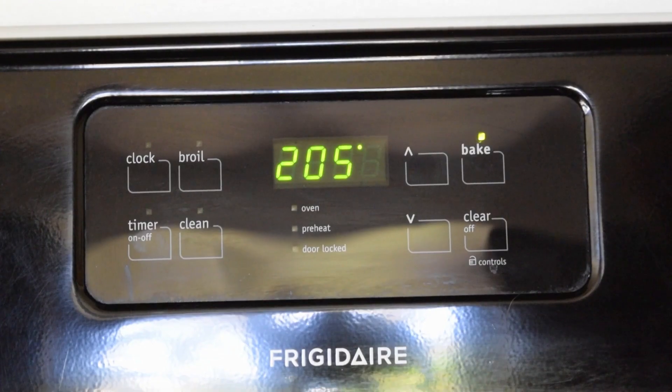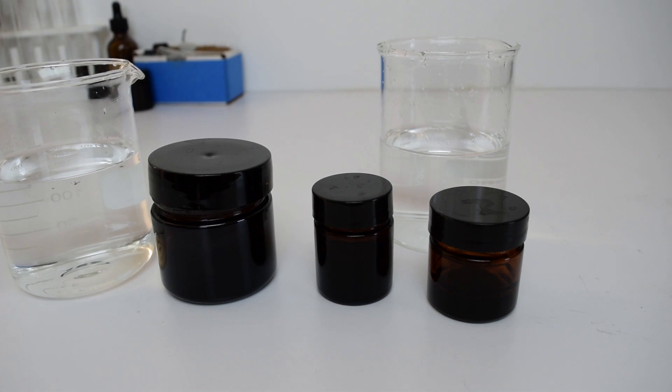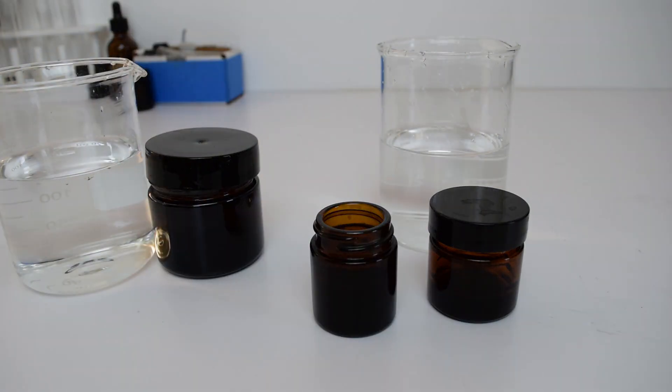Now add the containers to a preheated oven at 205 degrees Fahrenheit or 95 degrees Celsius for six to eight hours. After that, let the containers cool to room temperature.